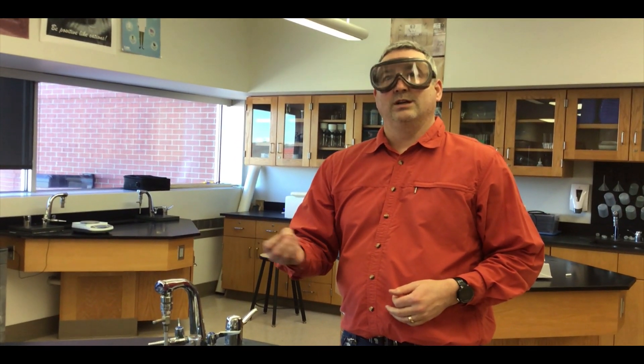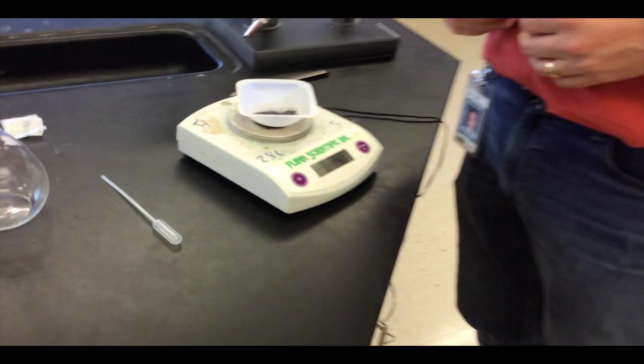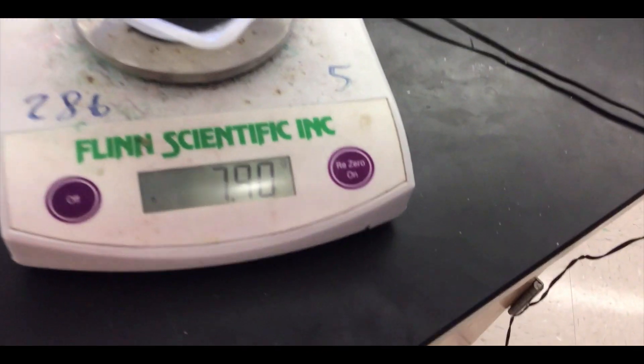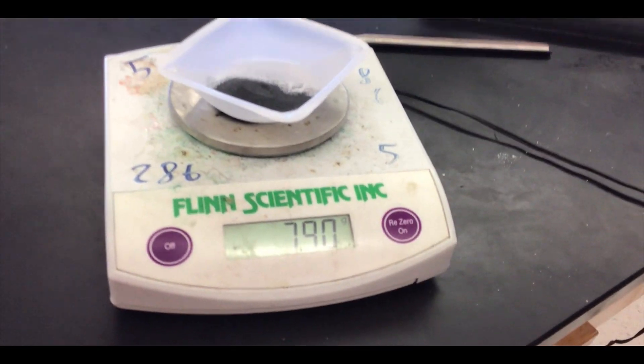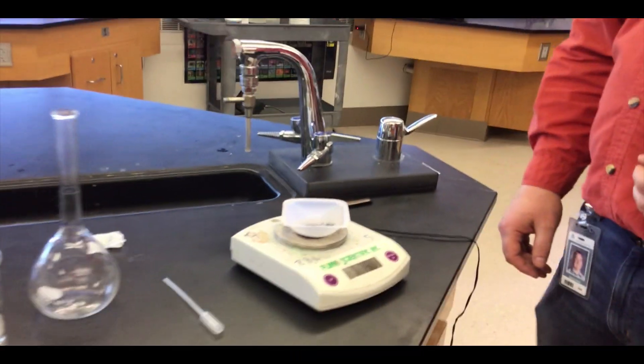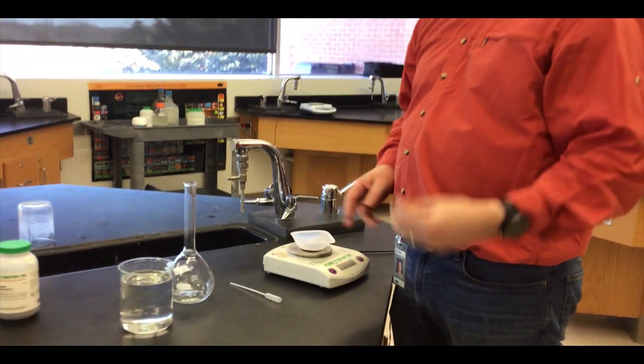We're making a specific molarity so we calculated what mass of potassium permanganate we need, which is 7.9 grams of potassium permanganate per 500 milliliters. We've done the stoichiometry to figure out that we need the 7.9 grams of potassium permanganate.